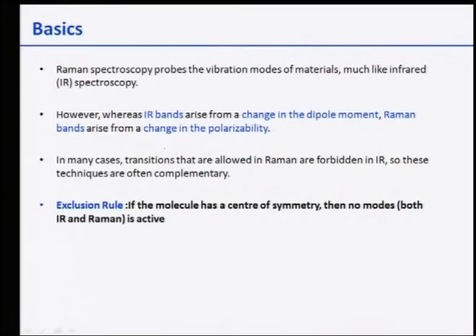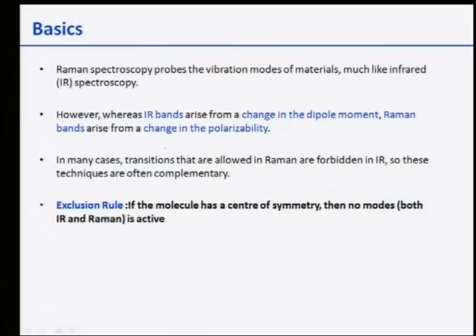As far as the basics are concerned, Raman spectroscopy basically probes the vibration modes of material. It is more like infrared spectroscopy. I have already discussed infrared spectroscopy a few classes back, and there I showed you by theoretical presentations how this IR spectroscopy is related to the vibration modes of the molecules. But there is a distinct difference between IR and the Raman spectroscopy.